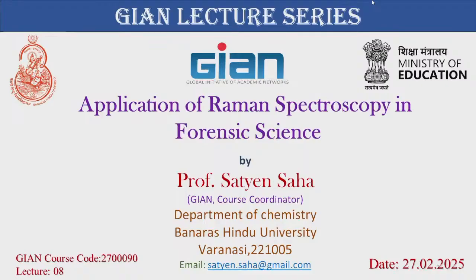So, welcome to this lecture. This is an application-oriented lecture, application of Raman spectroscopy in forensic science. In the last class, I talked about the application of Raman spectroscopy in the medicinal field, and today we will be talking about forensic science.